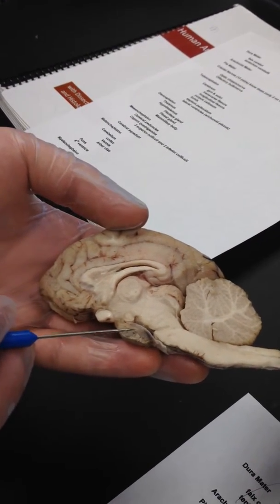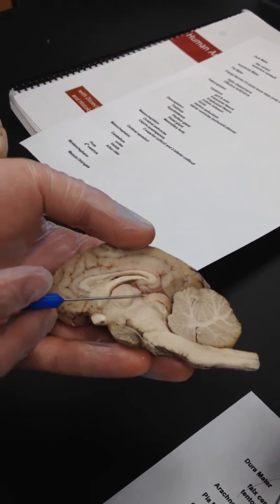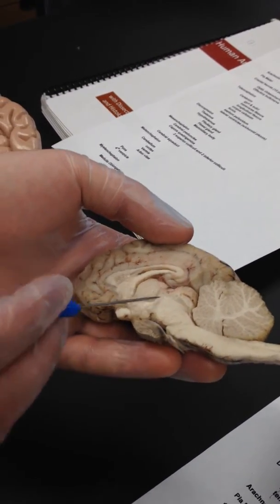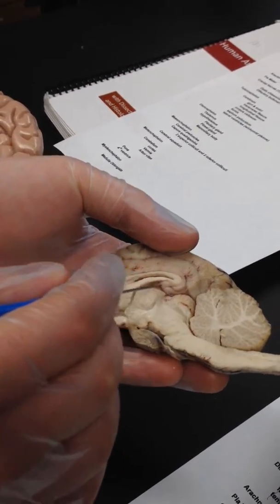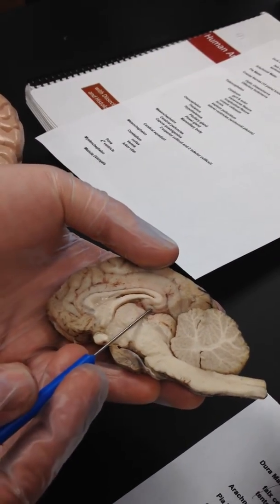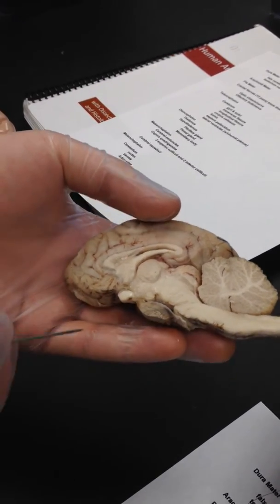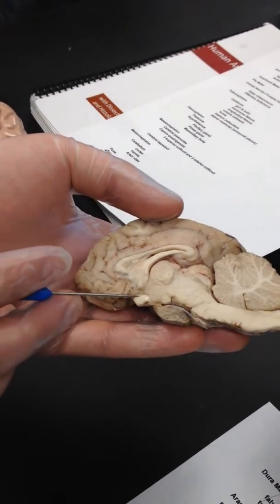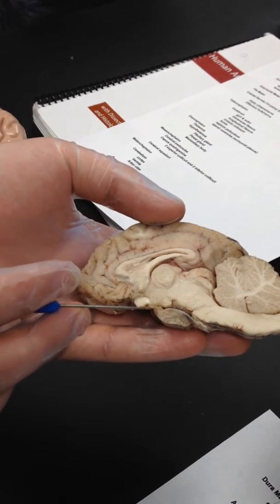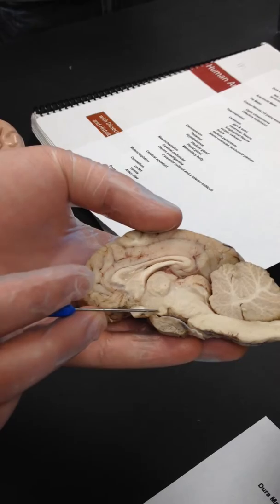And the pineal gland, out here it's been dissected out. One half of our brain got the whole pineal gland, but it would be sitting right here, right below the corpus callosum. The mammillary body, you can see here, is right behind the optic chiasm. So it's this little nub right here above the pituitary.